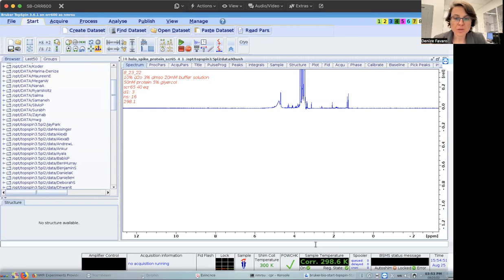So what I'm gonna do is put my sample in there. I am using a sample case, and my sample is at position 24. So I just type SX space position 24. Okay, while it's injecting my sample, I will create a new experiment.